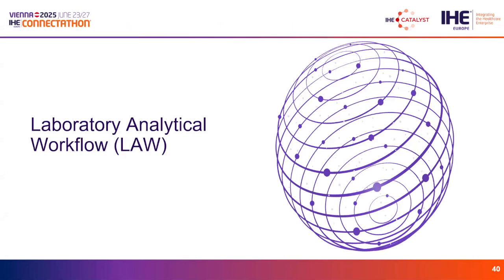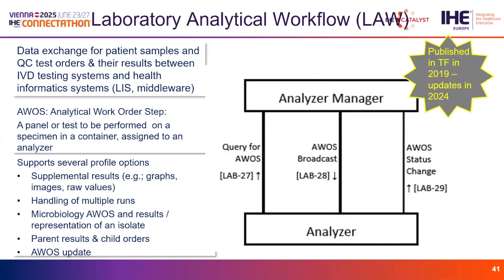Then, as I said just before, the laboratory analytical workflow, which is the profile related mainly to the in vitro diagnostics and related to the definition of analytical work order steps, that are mainly the tests to execute on a specimen by the analyzer.